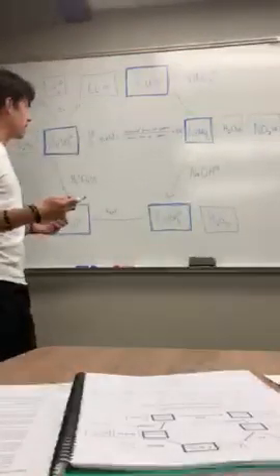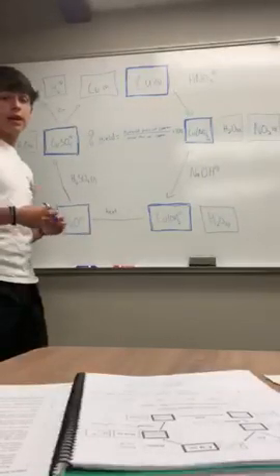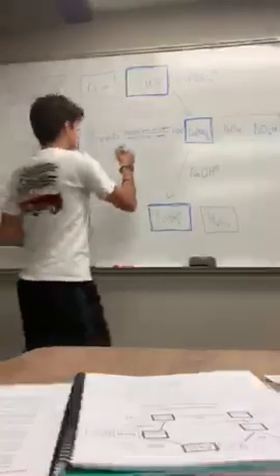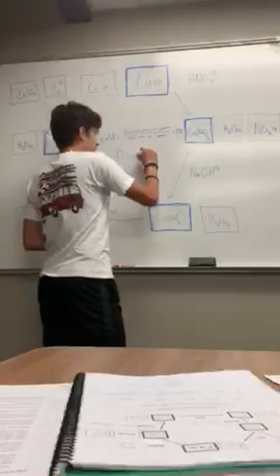So the copper that my lab partner and I measured at the end of the experiment weighed 0.330 grams.